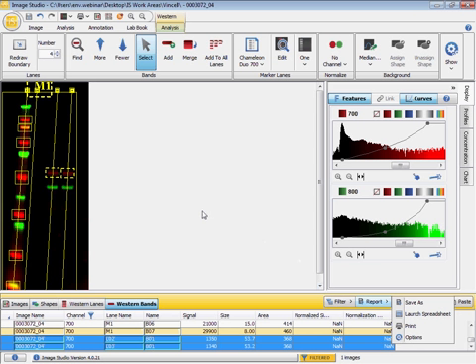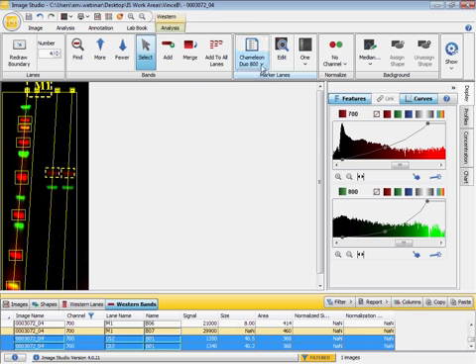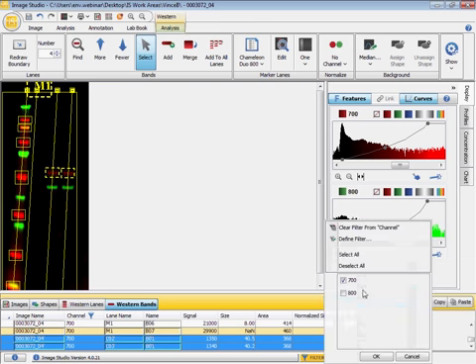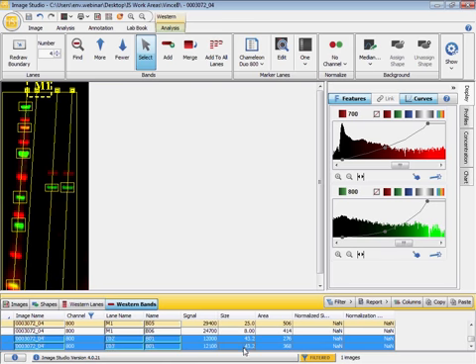And finally, we'll estimate the sizes of the 800 channel bands in the same way. Select the Chameleon Duo 800 ladder from the marker lanes group. And the only thing that you need to do from this point is to filter the table as we did before, and this time filter by the 800 channel. And as you can see, the 800 channel bands are shown in my Western Bands table with the appropriate calculated band sizes. And again, the 800 channel table can then be saved, exported, or printed for your records.